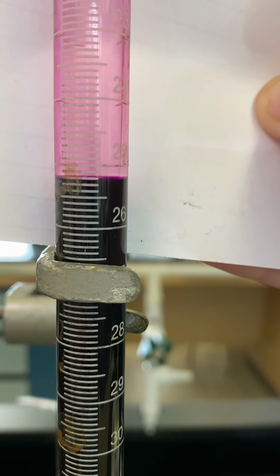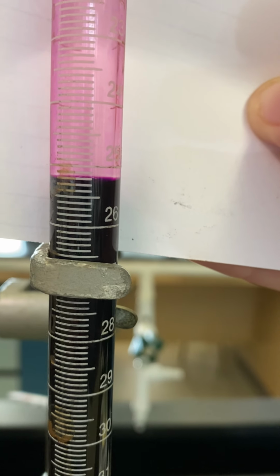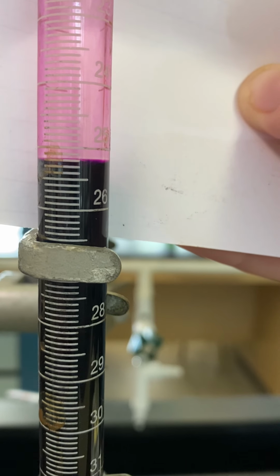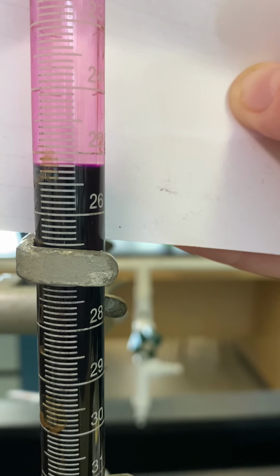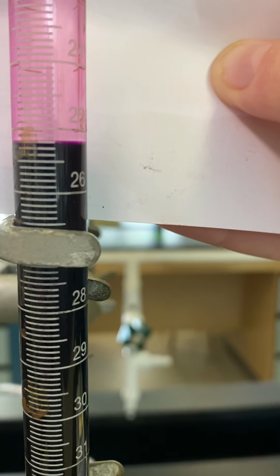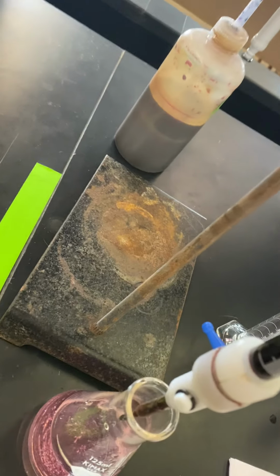I'm going to read it as between 25.1 and 25.2, much closer to 25.2, so I'm going to say it's 25.18. You might disagree and say it's something else, but we're writing on the same piece of paper, so you're going to say the same thing. 25.18 mL, and I'm going to write that on my sheet as my volume final.